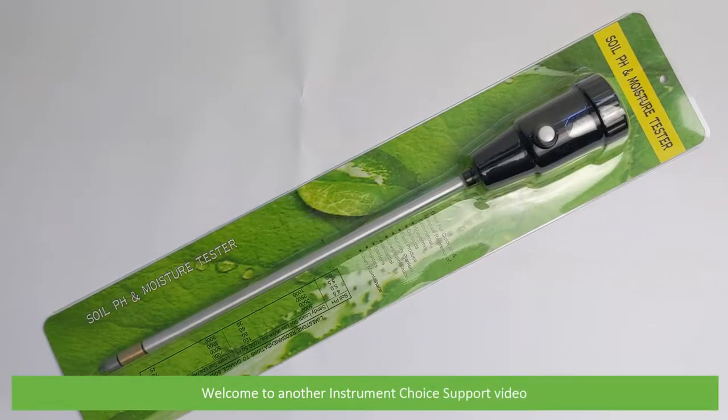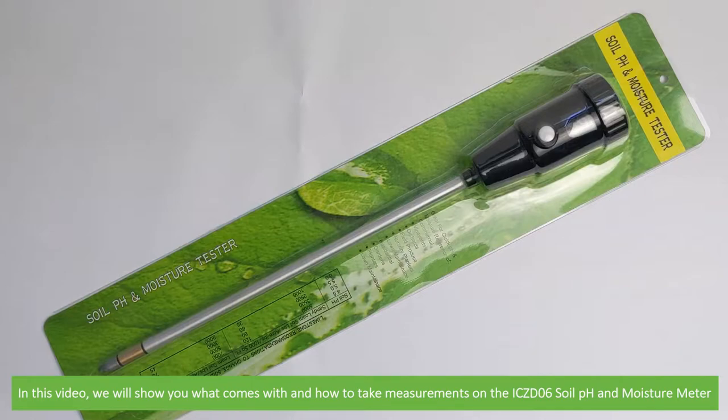Hi and welcome to another Instrument Choice support video. In this video we'll show you what comes with and how to take measurements on the ICZ-D06 soil pH and moisture meter.